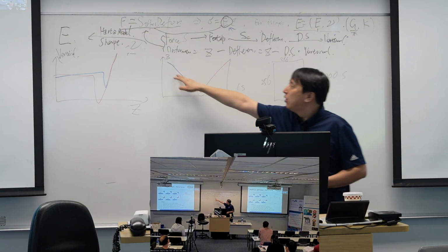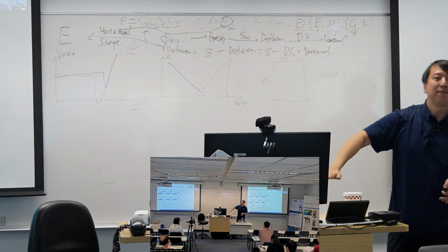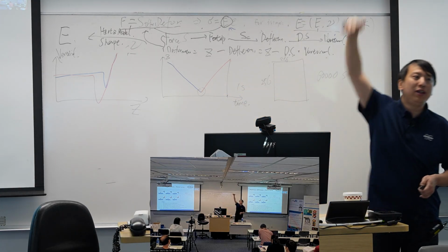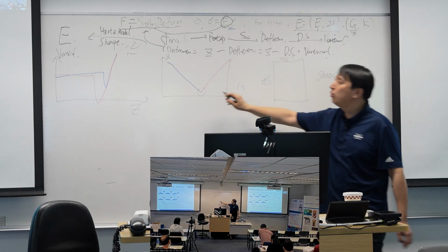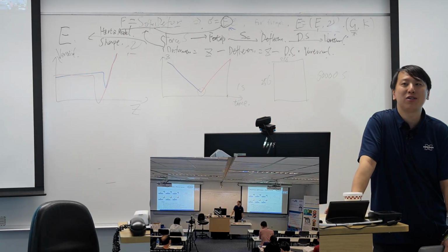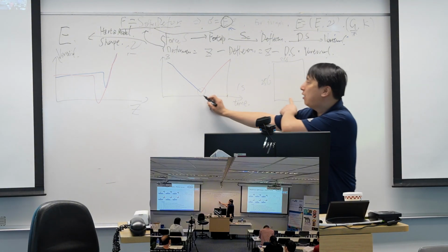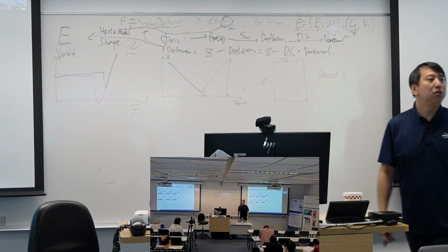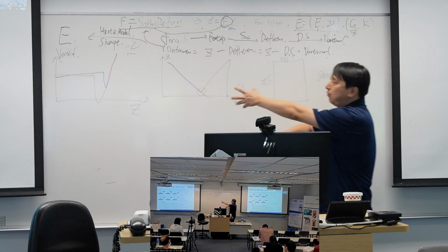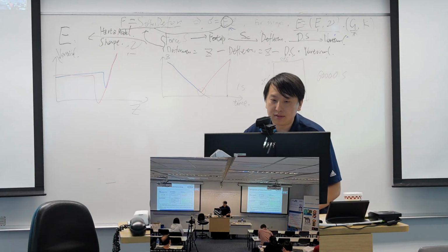The probe is moving down, and then you ask the probe to move up. Newton's law tells you that you cannot change the velocity that easily. You need to add some force.